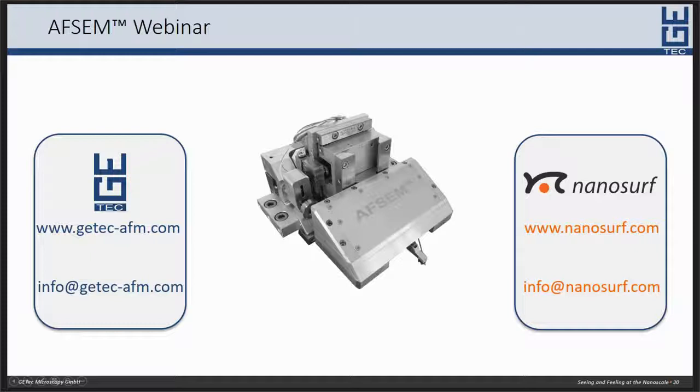Okay, and then we have one last question. Can I do quantitative nanomechanical measurements with the AFSEM? Of course you can. You can do that by taking force volume maps or by doing point-by-point force distance curve analysis of your sample at the exact spot which you have identified with the SEM and where you would like to do the nanomechanical analysis. For this, I would suggest that you use our calibrated diamond tips for the mechanical measurement.